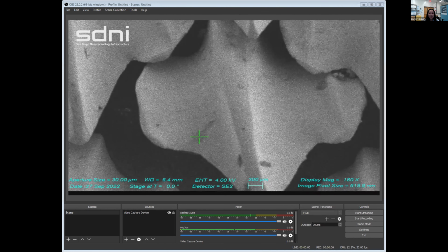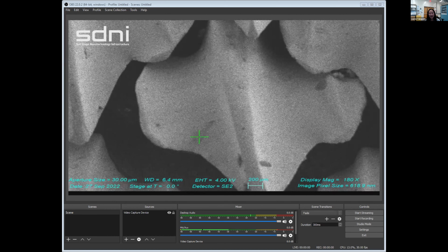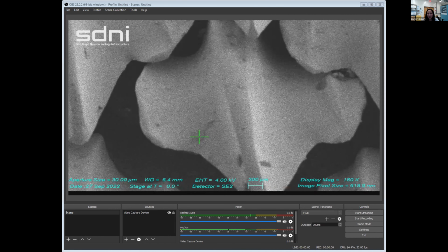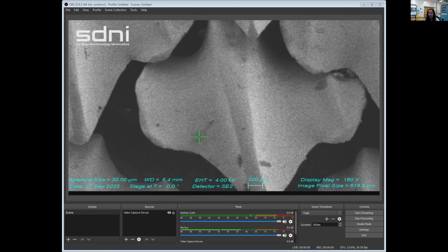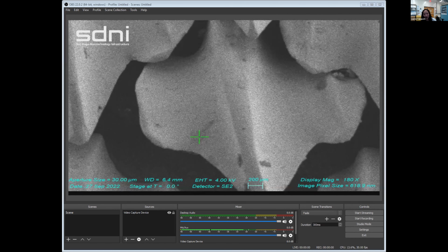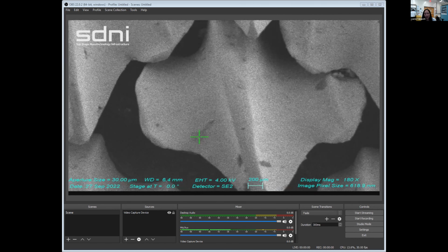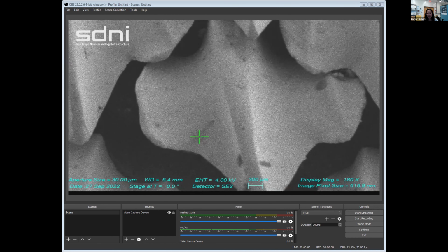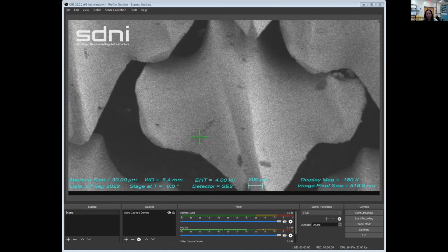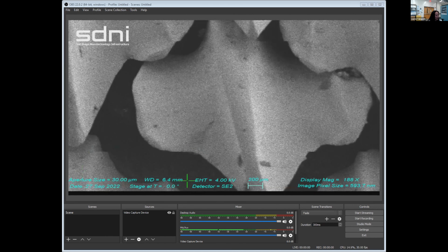Like I think someone mentioned the AFM, the atomic force microscope. In the lab that I work in, we work with DNA and DNA origami, so 3D objects of DNA, and because they have to be in a water solution, we can't look at them with an SEM, or else we'd have to dry our sample out, and it might lose its structure. So the AFM is another good tool that I think they're trying to get to be remote access too.